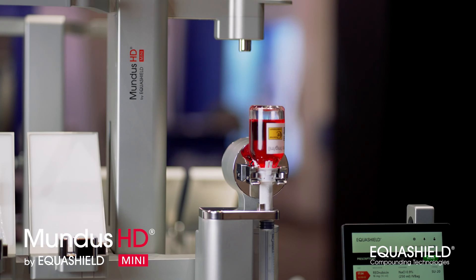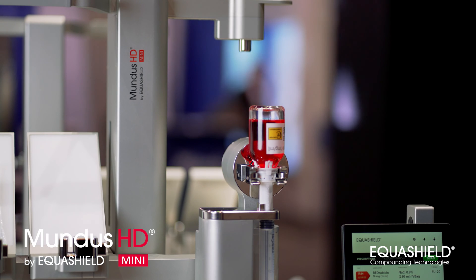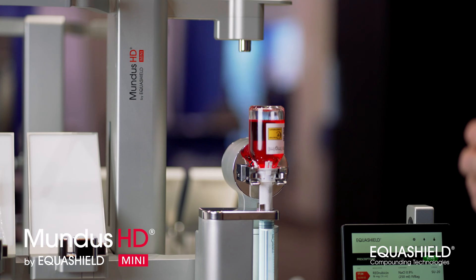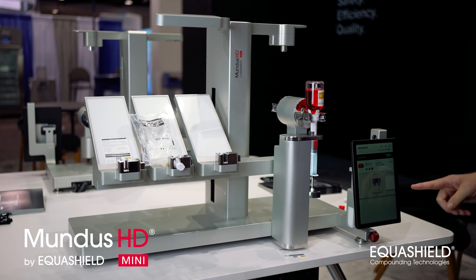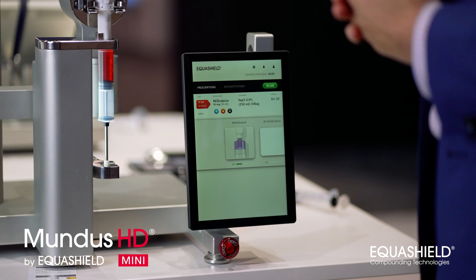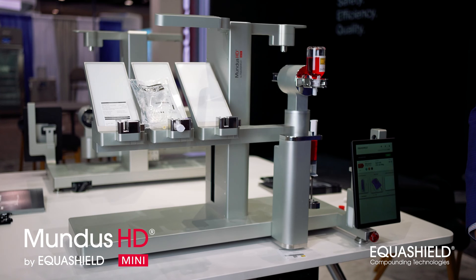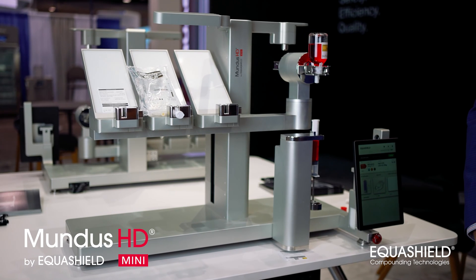This is where technology has evolved over the years to be able to have AI verification of the right proper dosage of the drug. You can see on the screen it's showing you that it is withdrawing the drug from the vial. Once it has the right amount, it's verified it within the camera and now it'll be injecting the drug into the IV bag. So it'll turn red.